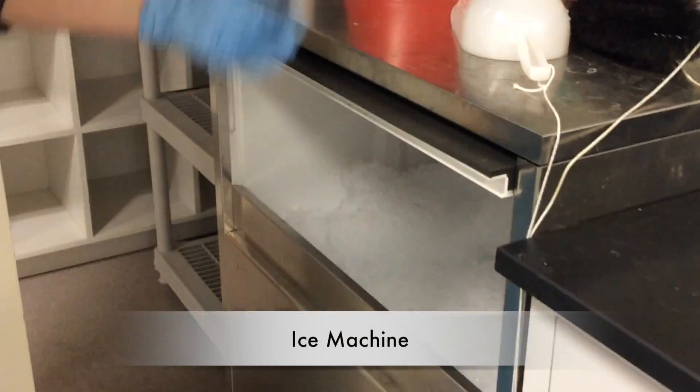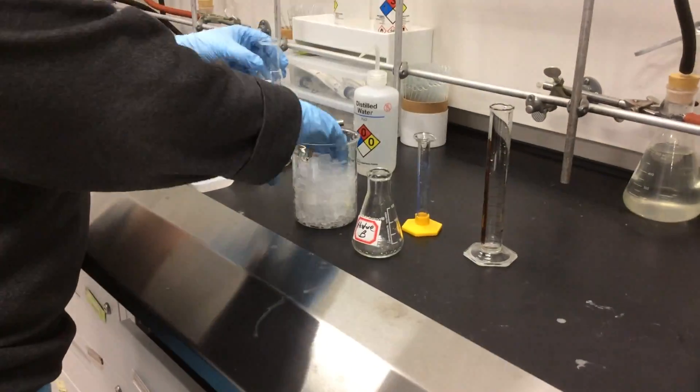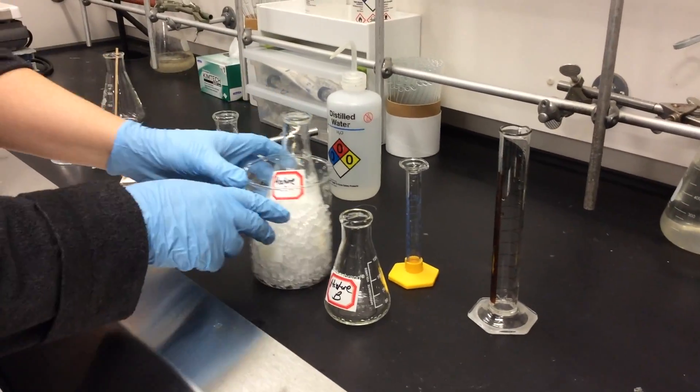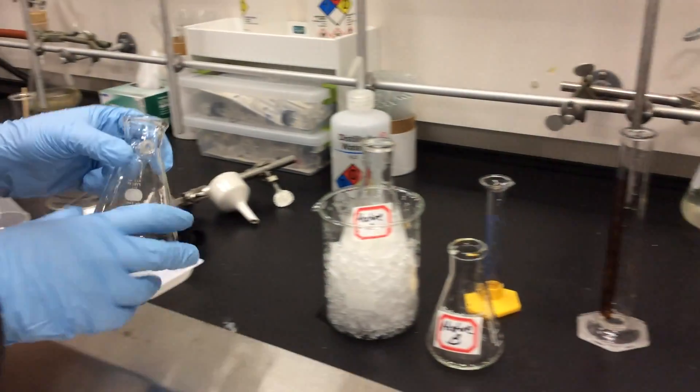Now we've come over to our ice machine. We take our empty beaker, fill it with ice, put our crystals in our ice to ensure maximum yield. Once we've done this, we have to set up a vacuum filtration, which we will use to isolate the crystals.